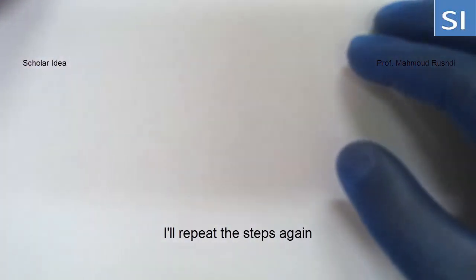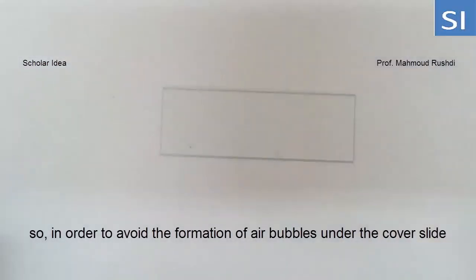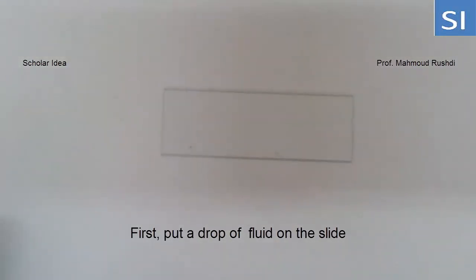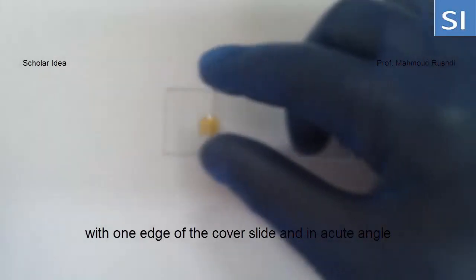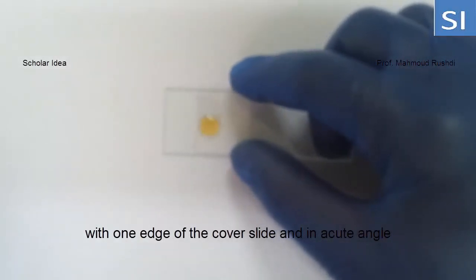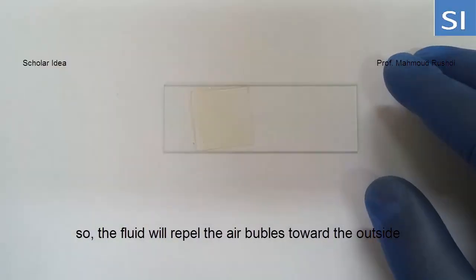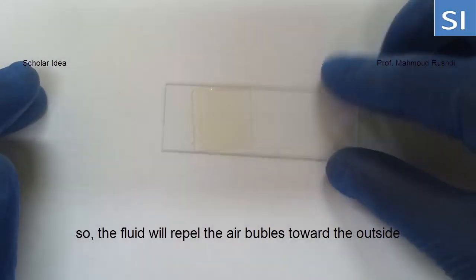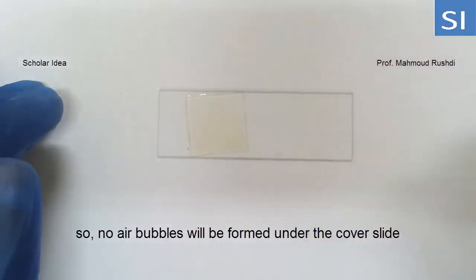I'll repeat the steps again. In order to avoid the formation of air bubbles under the cover slide, first put the drop of fluid on the slide, then touch the drop of fluid with one edge of the cover slide at an acute angle, and then leave the cover slide so the fluid will repel the air bubbles toward the outside, so no air bubbles will be formed under the cover slide.